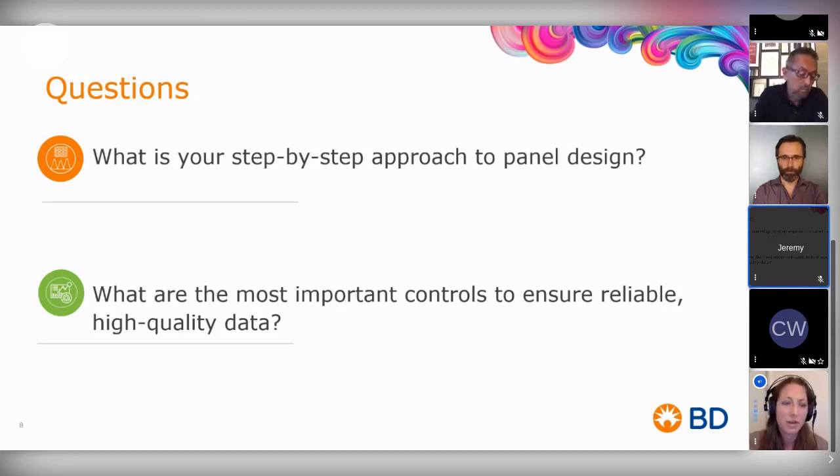And there are different types of validation that you can do. It depends how many people, for example, would be involved in that research. So you definitely want to do intra and inter-assay variation testing. And if there are multiple people, you also want to do inter-operator testing. And again, coming back a little bit to just working with the biology and not taking for granted that a reagent works in your system that worked perfectly in somebody else's.